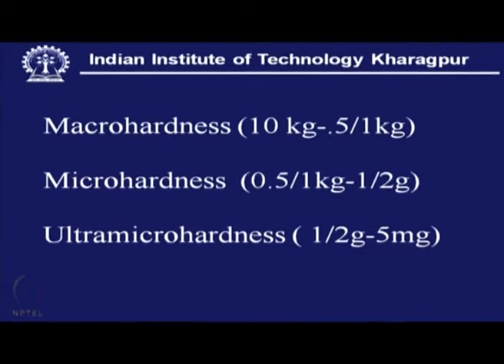The whole idea here is that in a material, after the heat treatment or as such, the material can have different phases on the top surface, and each phase has its own characteristics, and one of the characteristics will be some mechanical property, and that can be very well identified as hardness. So, one phase may show one level of hardness, while another phase can be quite high or quite low.